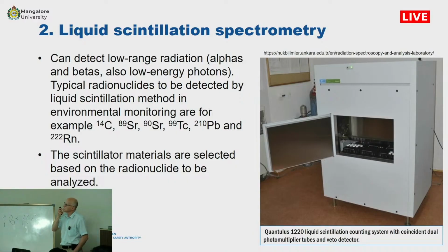All right. So these are the nuclides that are usually analyzed by the liquid scintillation method. You are mainly analyzing this. Do you analyze these? Tritium. Yeah. All right.